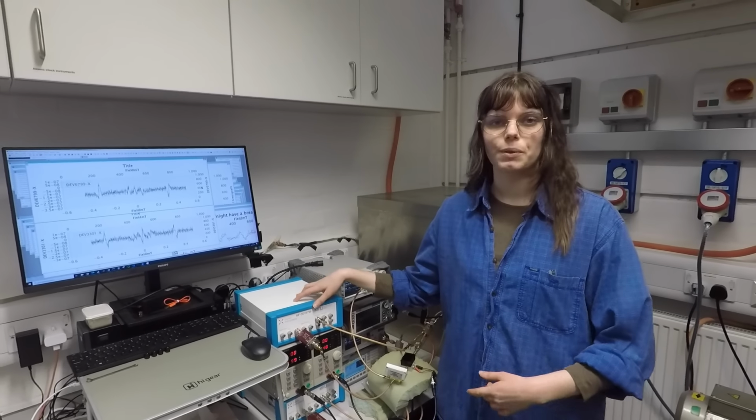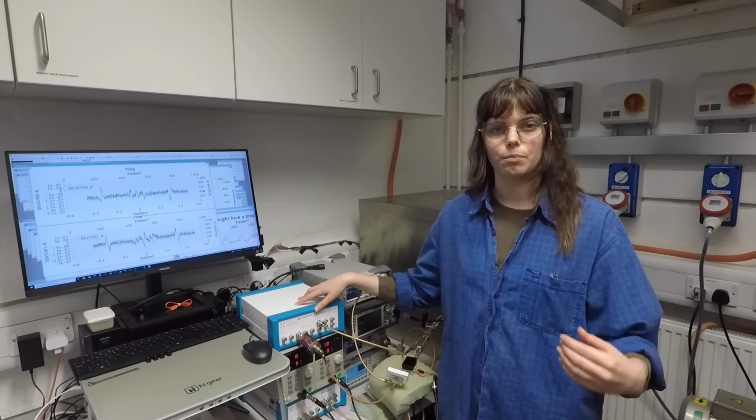So a key component in all of this is the lock-in amplifier. It's what we use to take the measurement, but also to process the data. And so next up is Ed, who's going to tell you what a lock-in amplifier is and how it works.